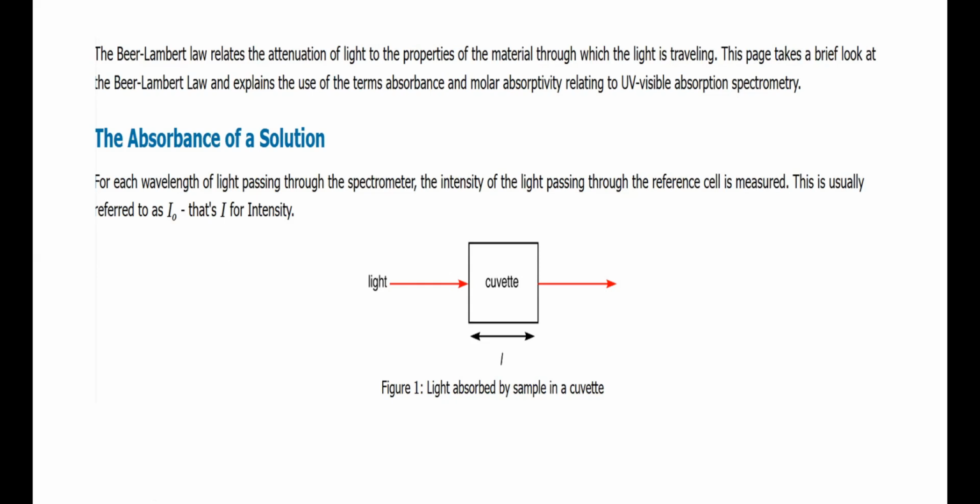But when the molecules are biological molecules, this rule is going to be applicable up to a particular limit, beyond which the complexity of the analytes will not allow this Beer-Lambert's principle to work, and the same applies in simple chemical solutions like copper sulfate or KMnO4 when that solution concentration exceeds, so that no light will be passing through it, no light will get transmitted through it, all the light will get absorbed.